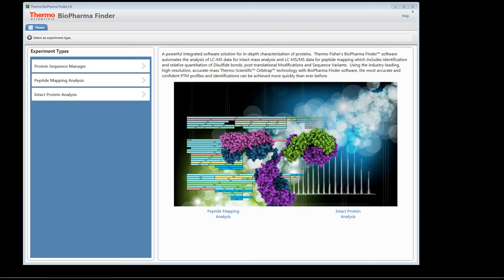Welcome to the BioPharma Finder help video. In this example, I'm going to show you how to process an intact protein analysis experiment.